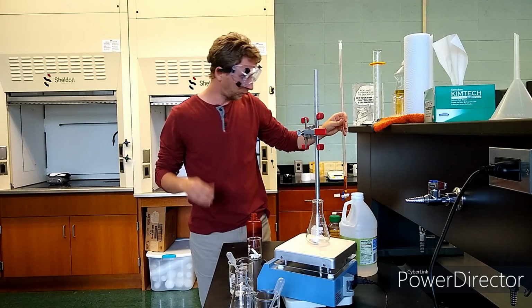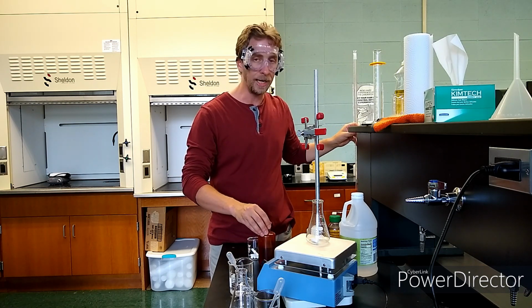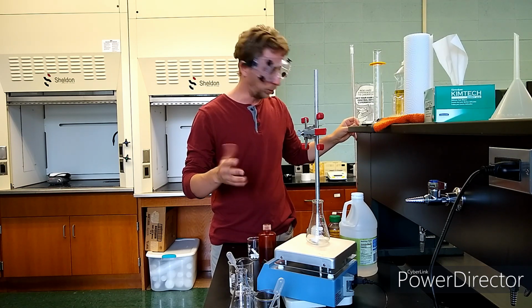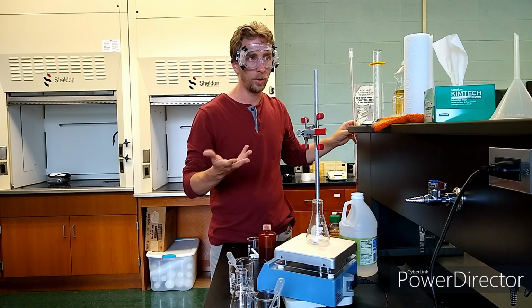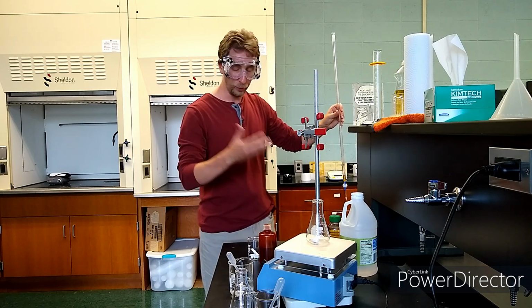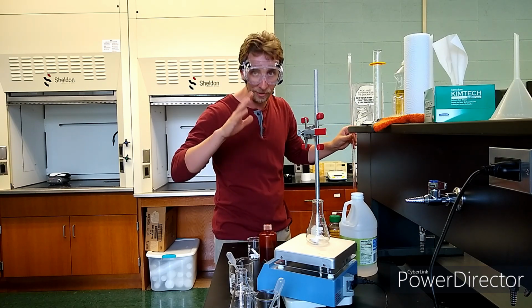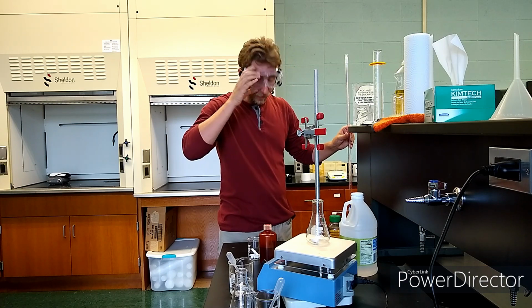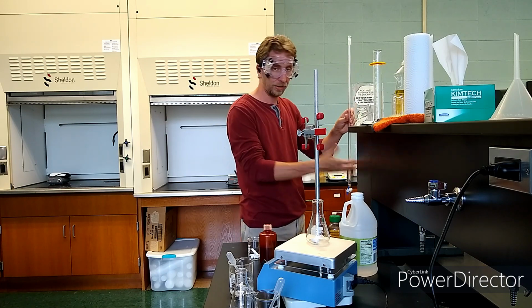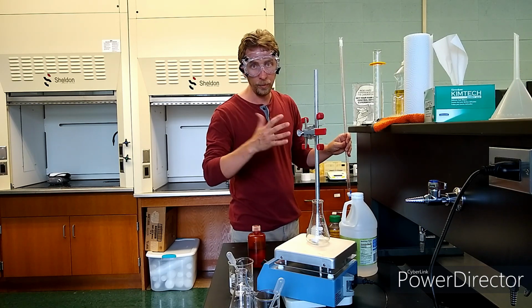Now, iodine is a very strong oxidizing agent. It's a common antiseptic that is used in hospitals to sterilize instruments like surgical tools, and sometimes I've even heard that doctors would rinse their hands in iodine solutions. Anyways, the reason it's good for that type of thing is because it oxidizes the mess out of everything. And so if you get it on your skin and it's very concentrated, it will sting very badly. If it's dilute, like we're using a very dilute solution, then it might have to sit there for a while, and at minimum, it will stain your skin.